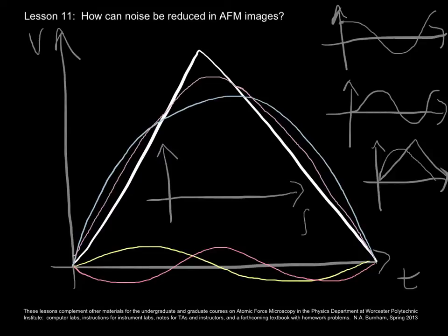Frequency and voltage, and the blue would be the fundamental at a strong amplitude, and the rose would be 3 times that frequency at a lower amplitude, and then the next one would be number 5 up here. Turns out it's at a lower amplitude still, and that goes out in frequency.